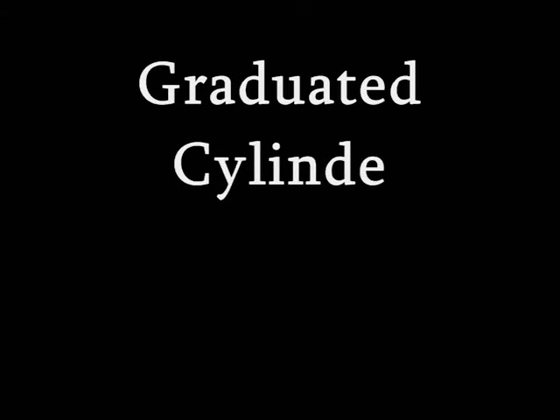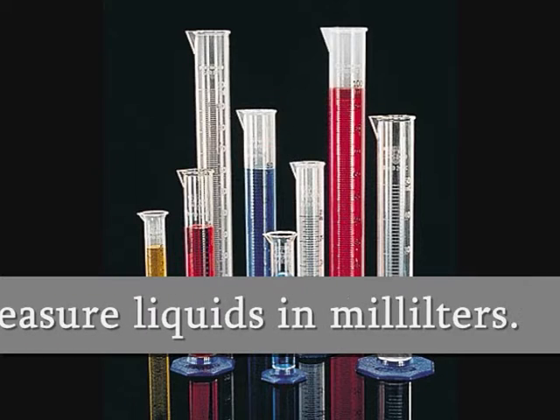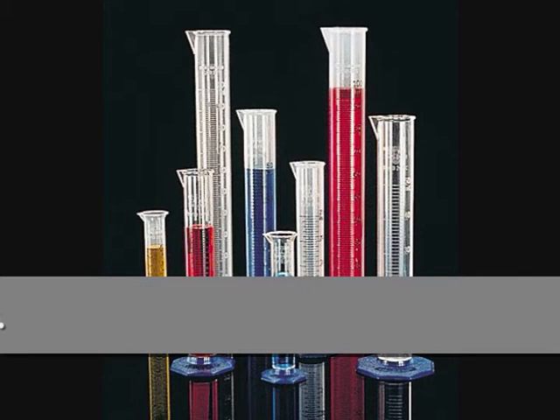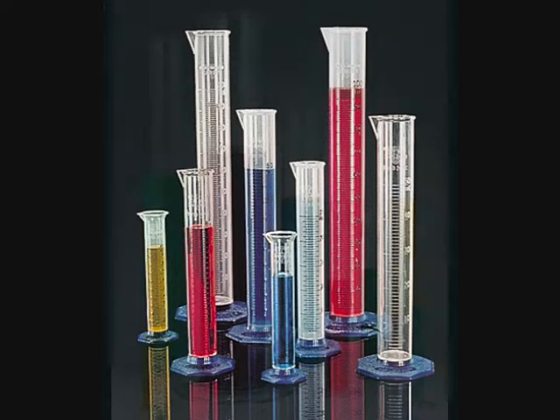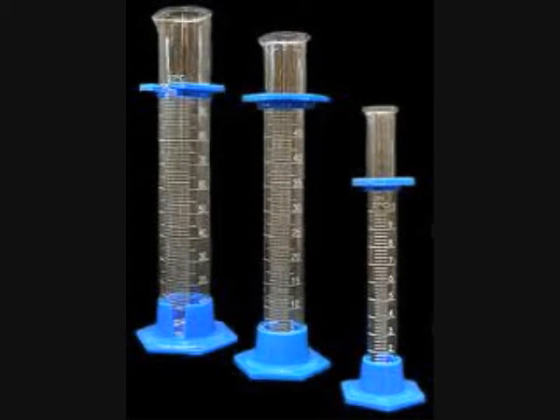Graduated cylinder. The graduated cylinder is used to measure liquids in milliliters. The graduated cylinder comes in a variety of sizes, big, small, depending on the amounts that you are measuring. The plastic piece at the top is used to protect the lip from being broken or getting chipped.